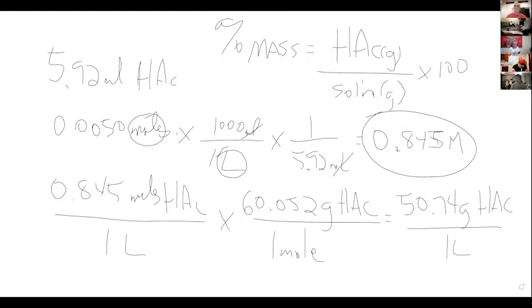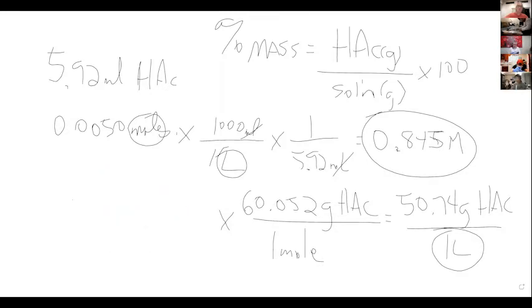So remember that if this was water, what's the mass of a liter of water? How much would 1,000 milliliters of water weigh? How much does 1 milliliter of water weigh? What's the mass of 1 mL of water?